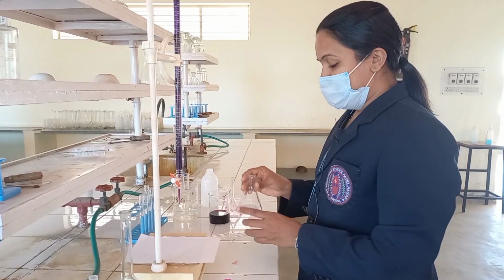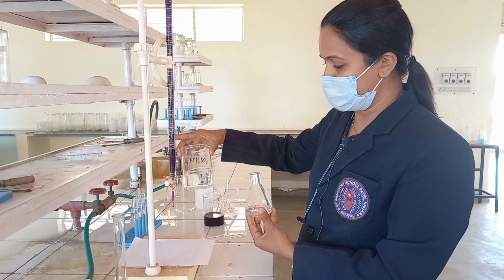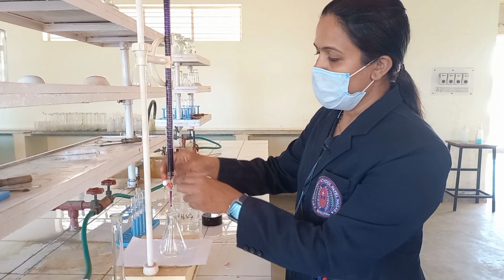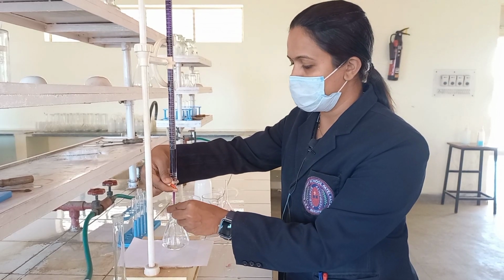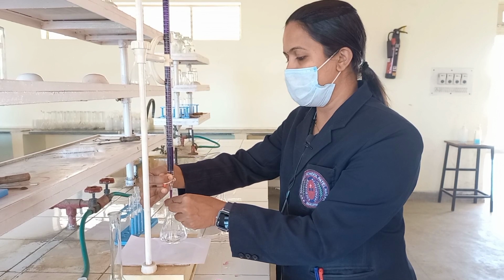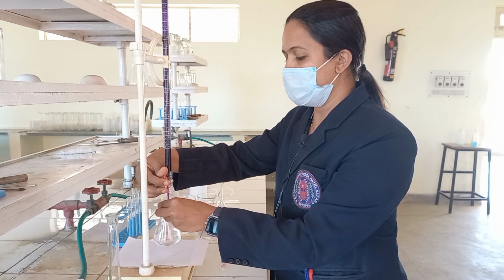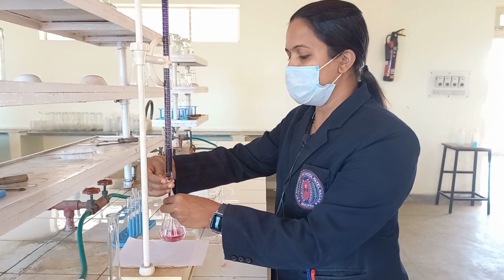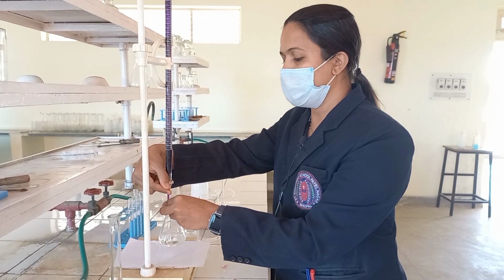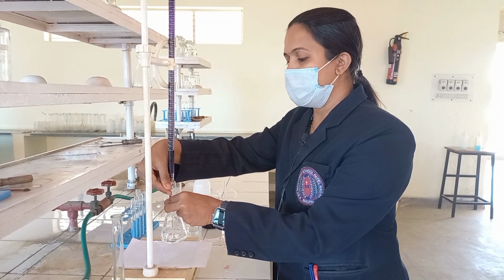Now for performing this experiment, what we have to do: we have already taken the standard solution, and we added 4N H2SO4. Now I will keep this below the burette, and then I'll start pouring the solution from the burette into this conical flask. You will observe that as soon as I start pouring it, the color will change, but when we start swirling it, the color will disappear. The end point of this titration is from colorless to light pink.